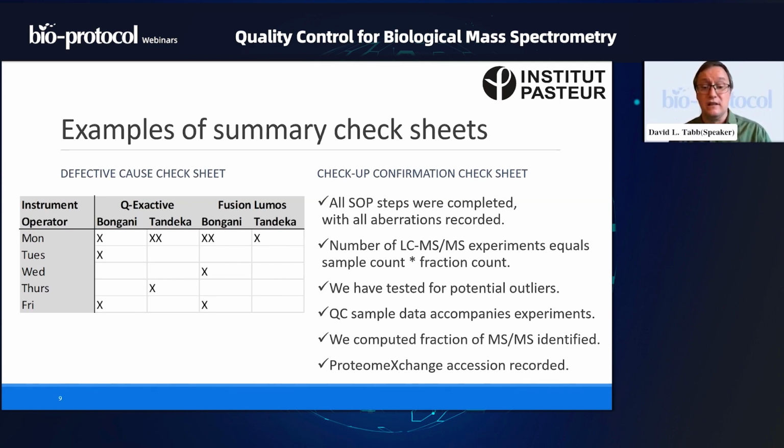In some cases, like biofluids, if someone was shooting plasma or serum, identifying 20% would be a miracle. It would be a miracle, and everyone would be writing to you trying to figure out how you did it. On the other hand, if you're shooting something like bacterial guts on your instrument and you had a huge amount of sample to work with, identifying 20% would probably be kind of disappointing. So being able to compute the fraction of all spectra that were satisfactorily identified is rather important.